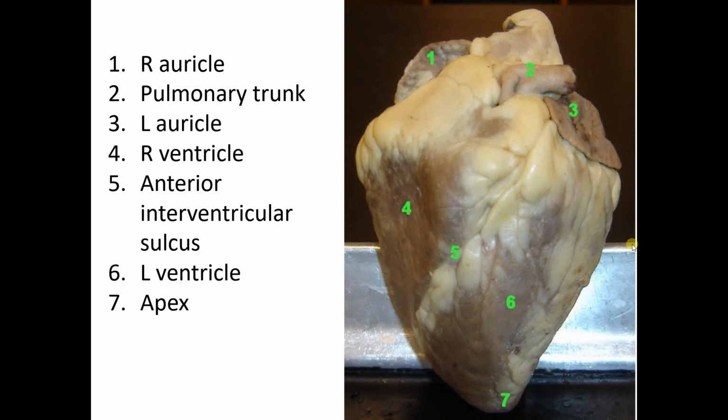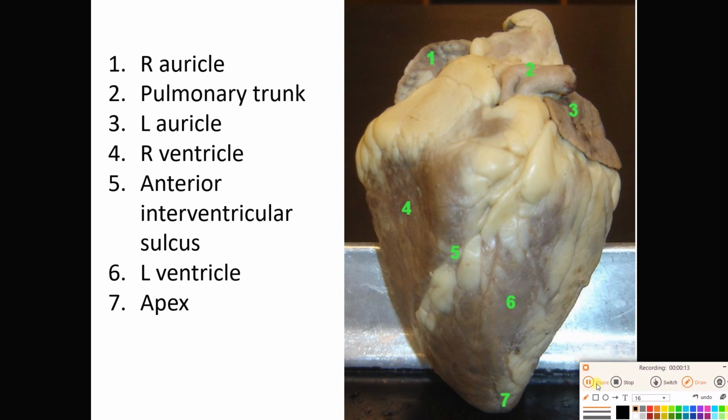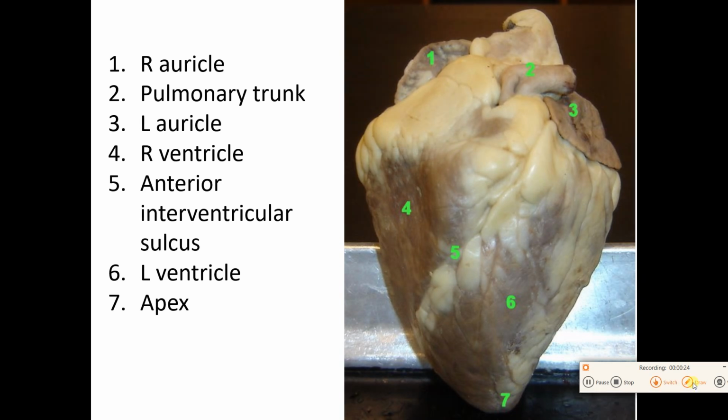What's up, everybody? We are moving on to our second lab on the heart. So last time we met, we did a bunch of basic heart anatomy. So I'm assuming you're good with that. All right? Hopefully you are. What we're looking at today is a sheep heart.